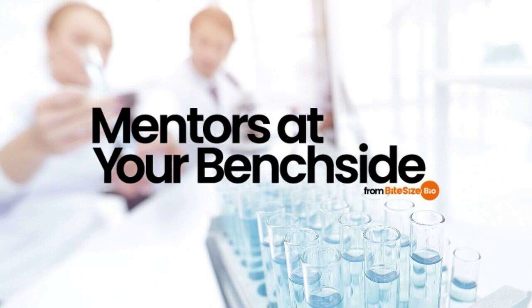For routine examination, H&E is the stain of choice. It adds color to otherwise transparent tissue sections so that you can get a detailed view of the tissue structure under a microscope. As the name suggests, H&E is a combination of two dyes, hematoxylin and eosin.